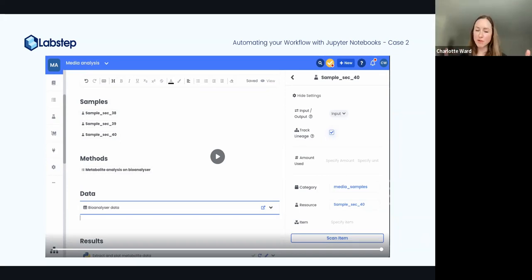Yeah, for sure. I mean, you can run things as many times as you want. As you say, you can make some standardized scripts that you put into a template, put into a number of experiments and run them however you want on different kinds of inputs. Or you might have an experiment where you want to constantly tweak your inputs or the kind of analysis you're doing and then just keep rerunning the script. And these scripts are made to be run and rerun. Cool. And I guess that would probably save people a lot of time as well.